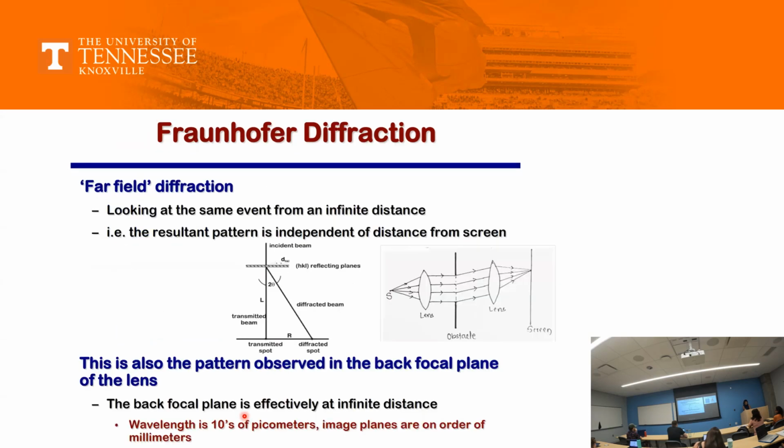Now, in Fraunhofer diffraction, this is one of the best diagrams that I could find for you guys. Here they're trying to keep the source very far and put two lenses, because everything is far. And in your TEM column, actually it is far. Now it depends where you're talking.